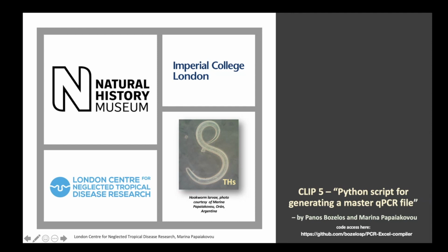This clip will show you how to: 1. Download the PCR Excel compiler repository from GitHub, and 2. Execute the script in a shell or terminal so that you can save some precious time in the future.